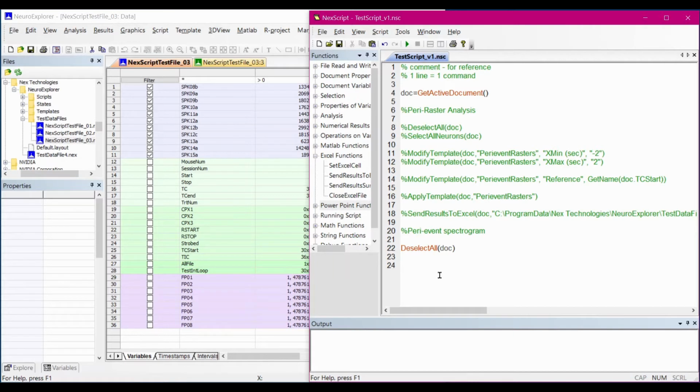So let's go ahead and write that. It's going to be for C number equal to 1 to 8. So what I'm doing here is assigning the variable C number the numbers that I want to go through and select. It's always a good practice to close your loop before you write code in between it.